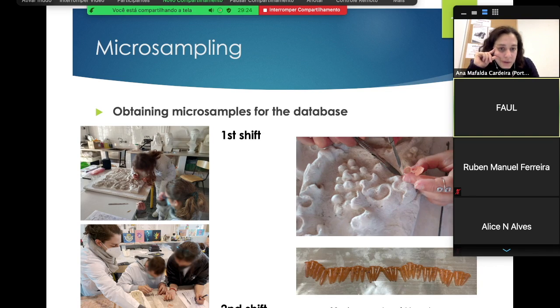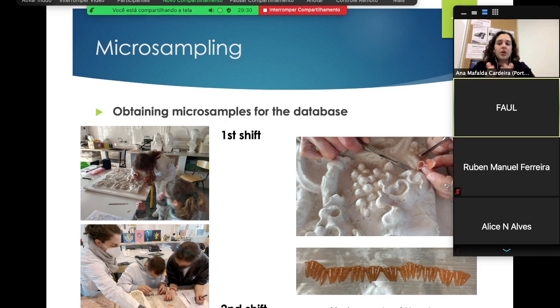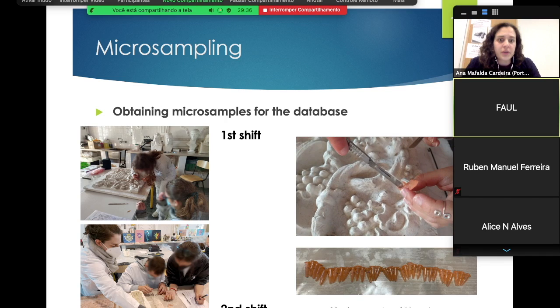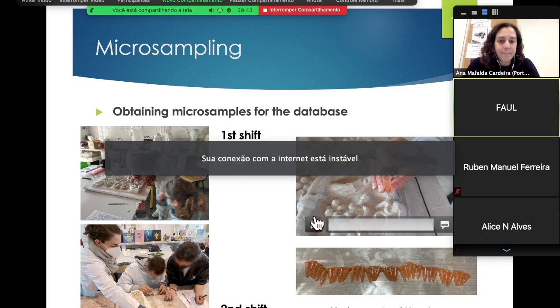Then I have a video, exactly. This is micro-sampling, so we began from the general to the particular as a methodology for the analytical work applied before they do the conservation and restoration of these works. And this is, when you see the video, I'm going to play it again.